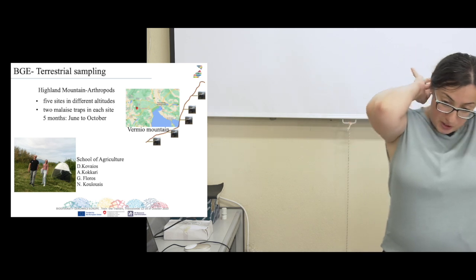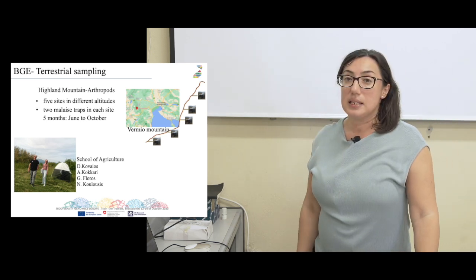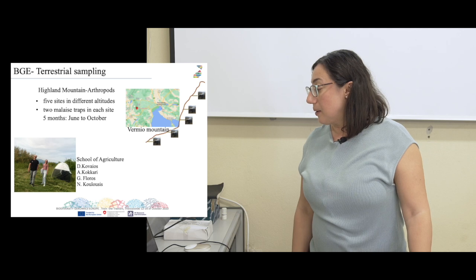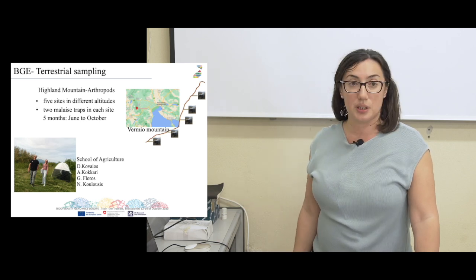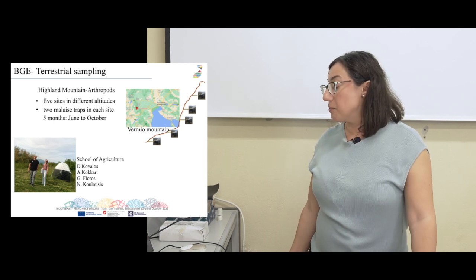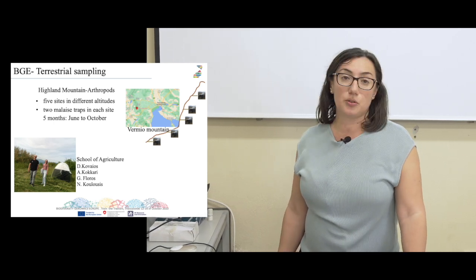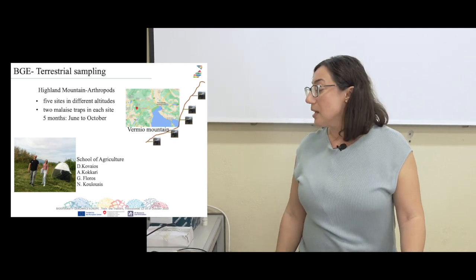Under the umbrella of BGE, the Arthropod team at the University of Thessaloniki is involved in this high mountain arthropod system study, where Malaise traps have been set at 5 different altitudes here in Vermio in Greece.